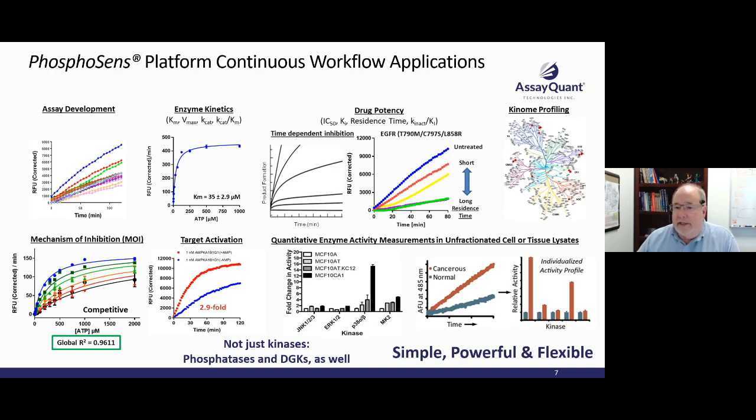So you'll see a decrease in the signal, your rate, as the phosphatase activity happens. And if you're actually looking at the endpoint, it's the same thing. You'll follow that signal decrease as well.